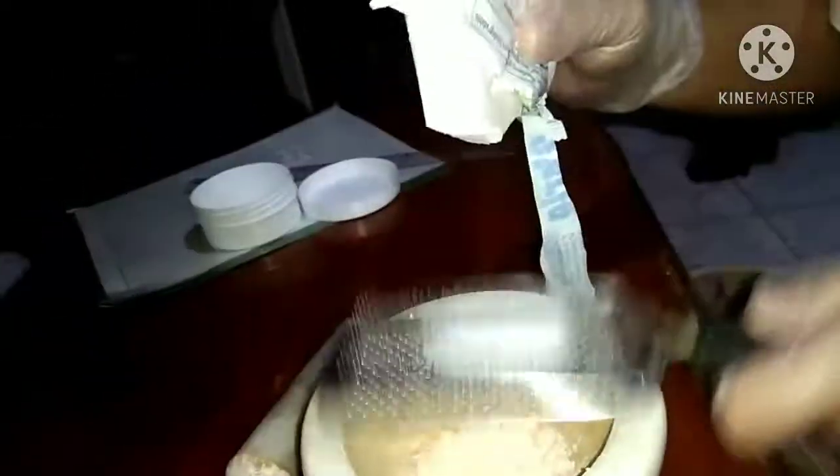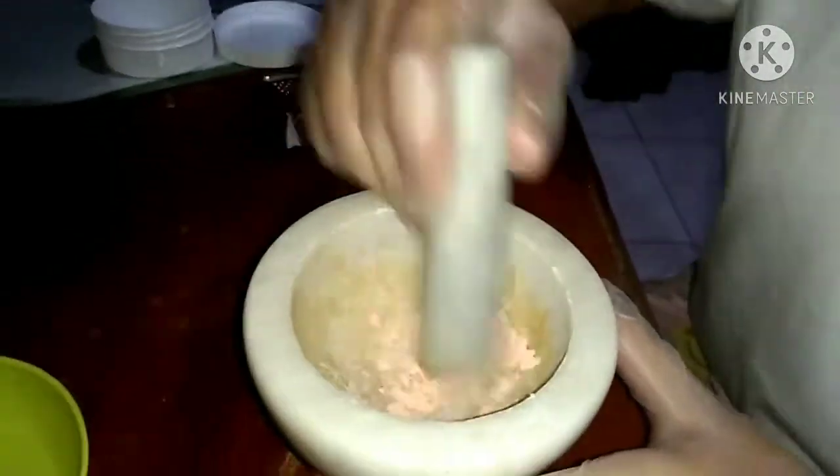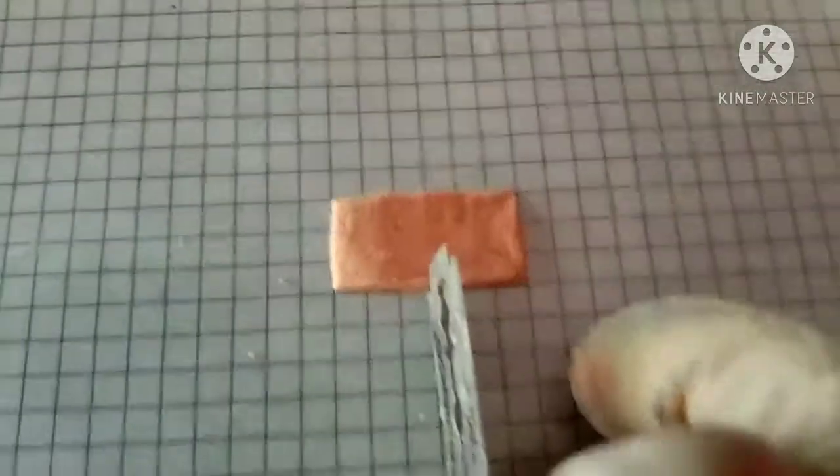Add a pinch of perla soap or flour paste, then mix. Add 2 drops of water to the mixed powder until a clay mass is formed.